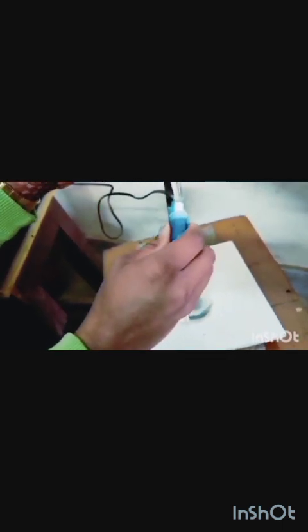That is, first the conductivity starts decreasing, but after the neutralization point it begins to increase. Note down 10 readings by repeating these steps until neutralization takes place, and note down the reading again and again.